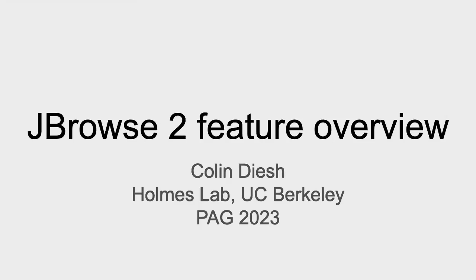I'm a very visual person, so I'm just gonna do a lot of screenshots and kind of cover and flesh out some of the things that Rob mentioned, which are our main goals.